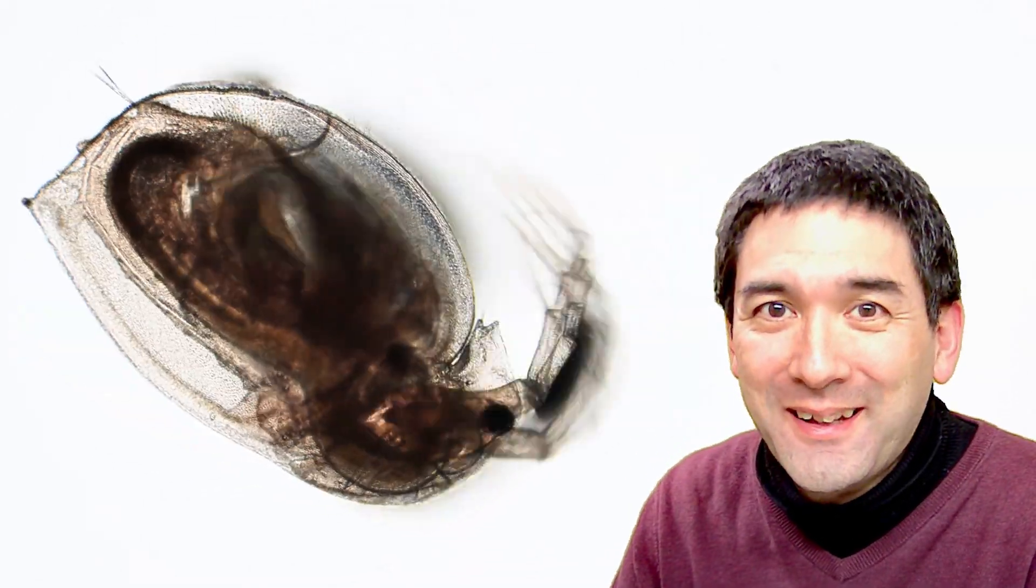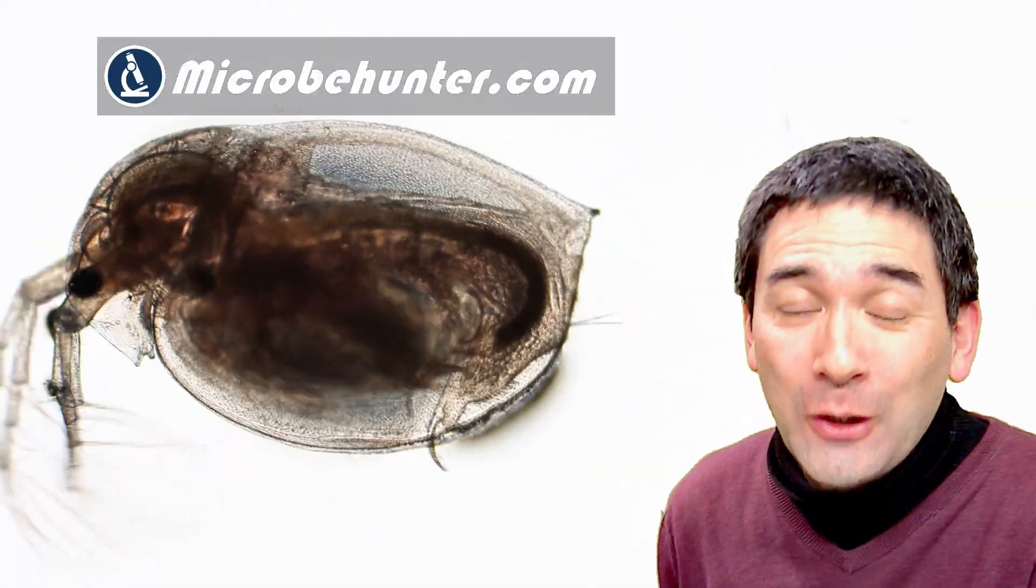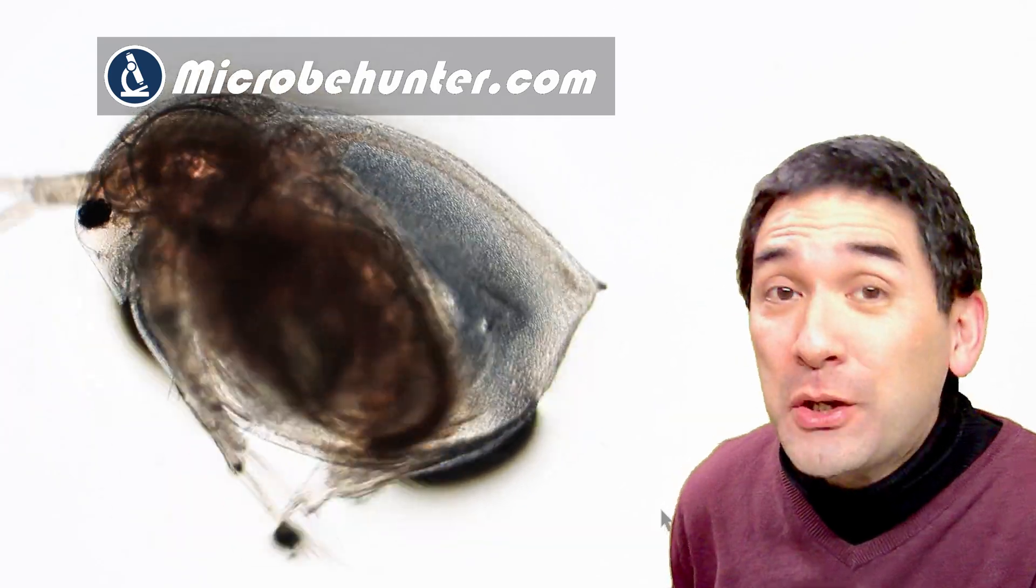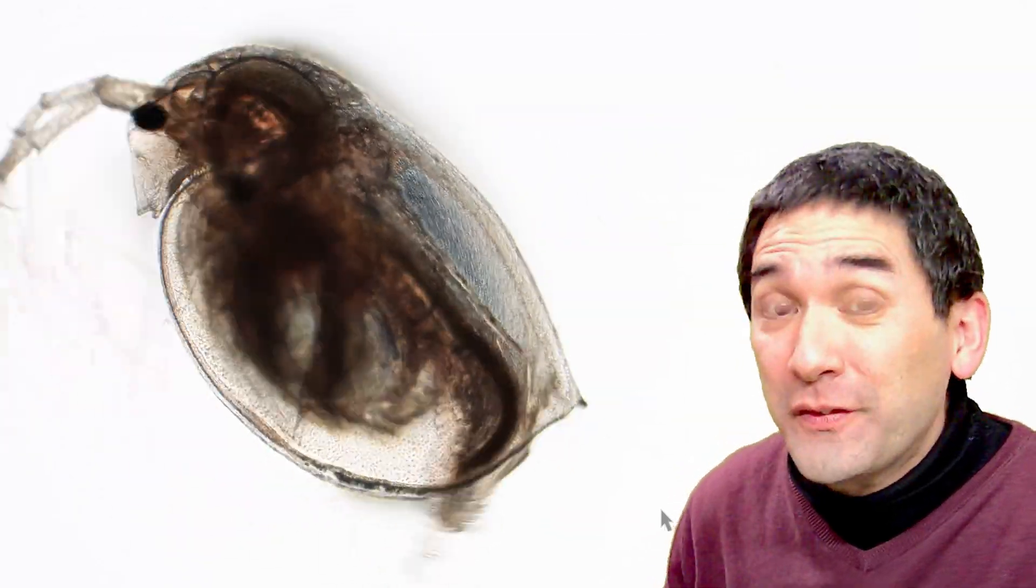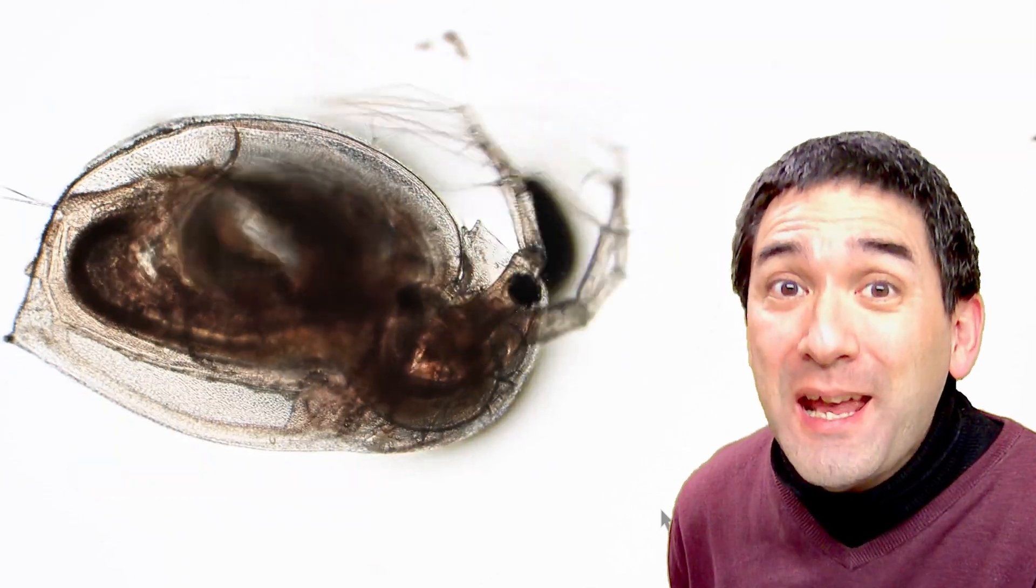Hello and welcome. Microbe Hunter here again, and I would like to add a little bit of alcohol to this little Daphnia here, a water flea, because I'd like to see and observe and experiment what effect alcohol has on the behavior of this water flea.